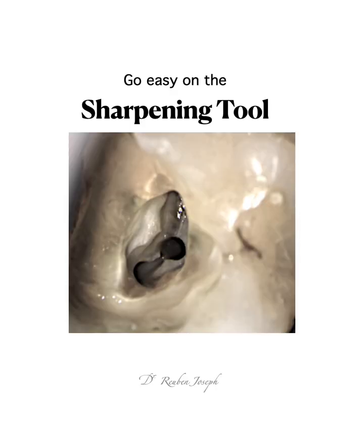Having mentioned sharpness, I would strongly recommend that you do not overdo it. Though it will clearly define the outlines of your picture, when you overdo it, the image looks like something straight out of a comic book, which is definitely not visually pleasing, and it looks too artificial as well.